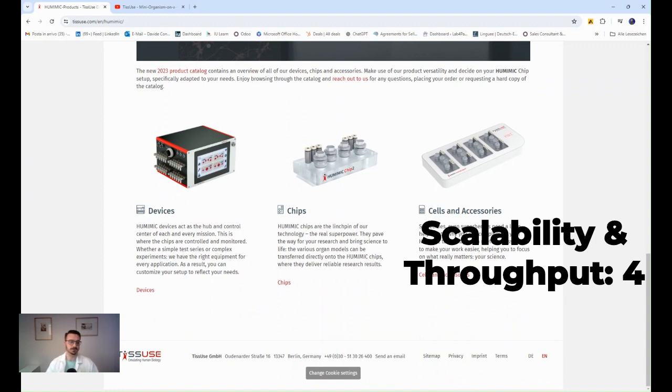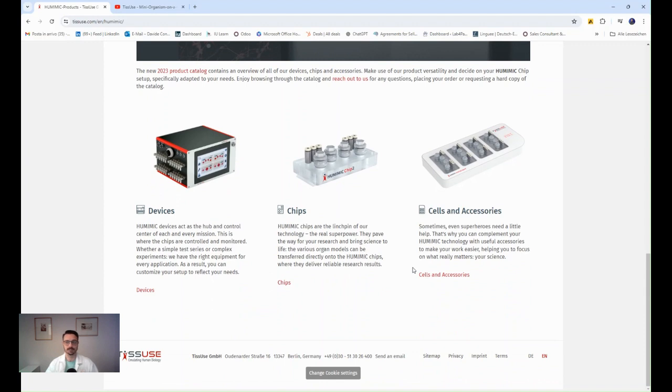In terms of the microfluidic design, this is also quite good, quite customizable. There are obviously some limits on what you can combine together, but this is relatively normal. All in all, you're obviously still limited by the kind of connectivity that the company is giving you, so we will give it a good 4.